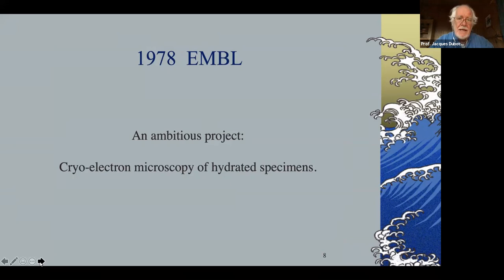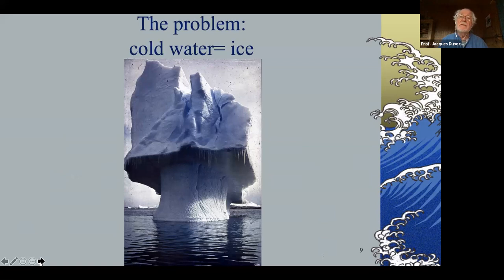My project was quite ambitious: cryo-electron microscopy of hydrated specimens, using low temperature to keep the water in the specimen. This idea is not very sophisticated, and it was performed before by several people, including Bob Glaeser in Berkeley. I was trying to revisit the problem. The problem, as you know, is that cold water is ice, and ice is about as bad as no water. Voila.